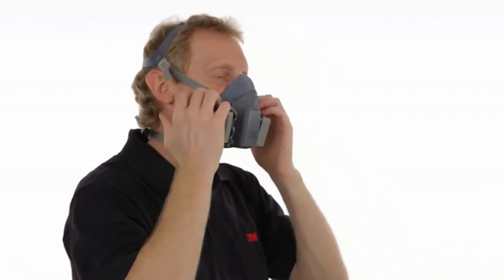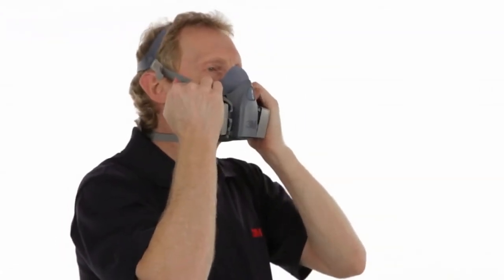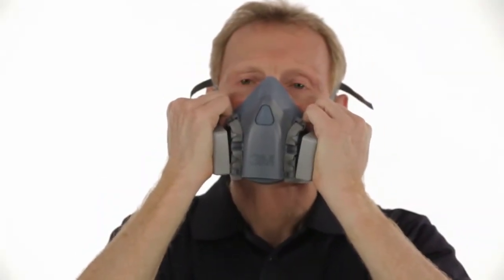After you've sealed the filter or cartridge inlet, inhale gently. If the facepiece collapses slightly and you feel no air leaking between your face and the face seal, your respirator has sealed properly to your face.